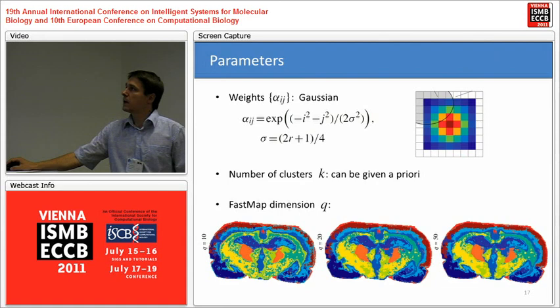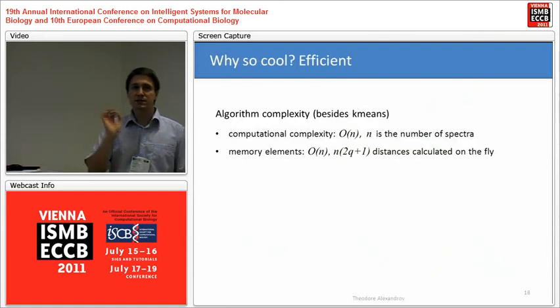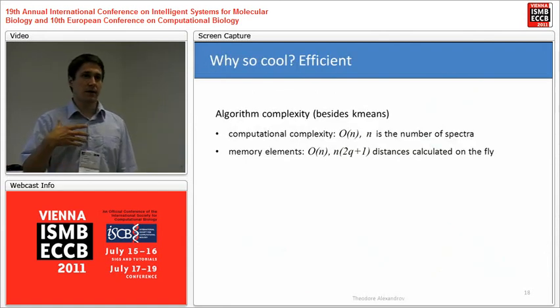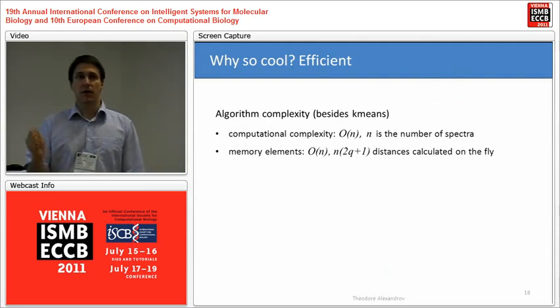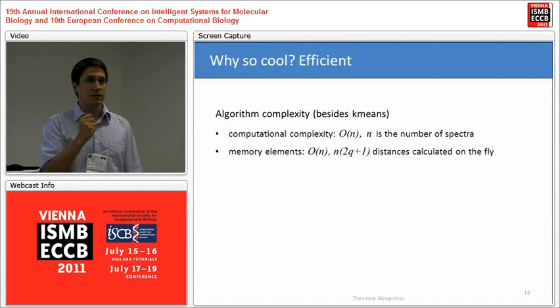But what's special in this algorithm? Why am I presenting it here? Because the complexity of this algorithm is really great. It's linear in time.